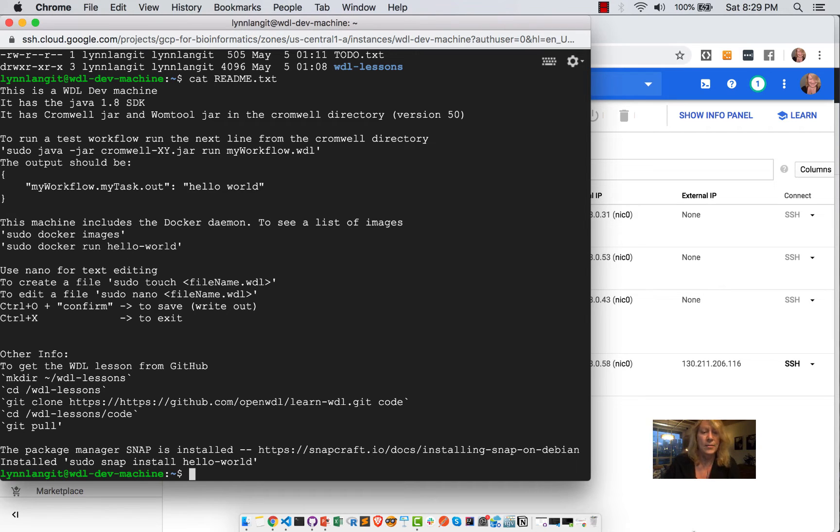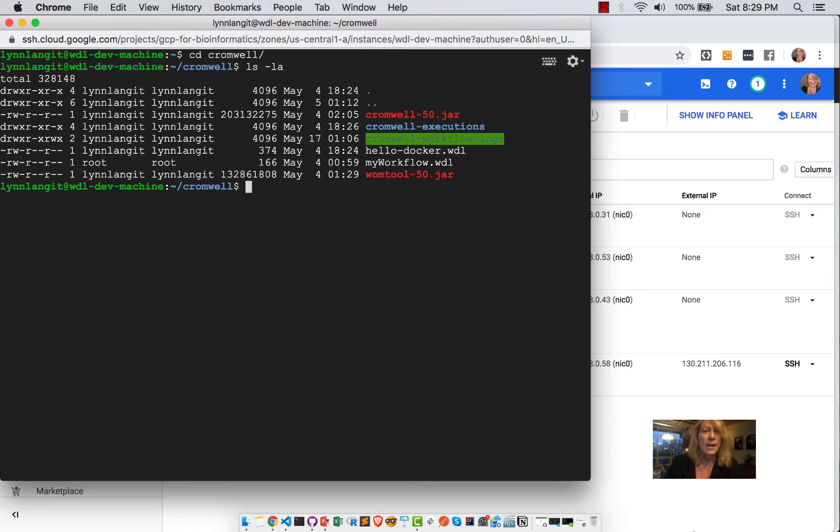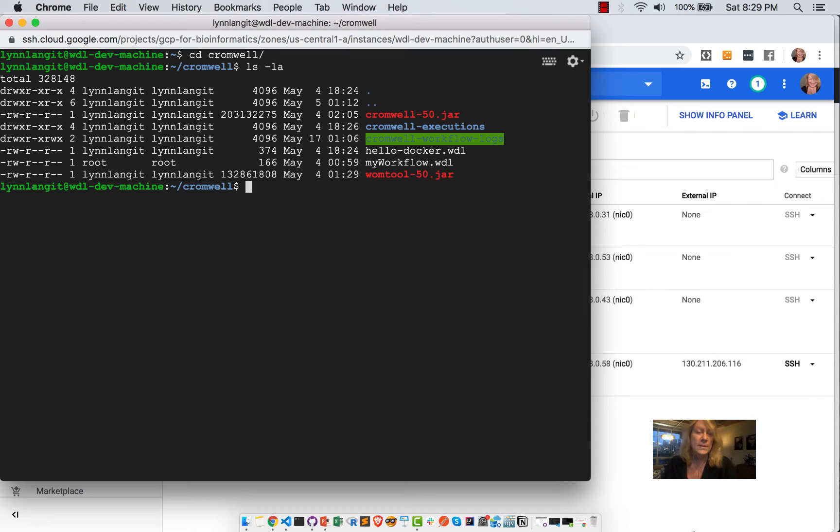So I'm now going to navigate to my Cromwell directory. And I'll show you that I have, as of this recording, the Cromwell 50 JAR file and the WAM tool 50 JAR file.